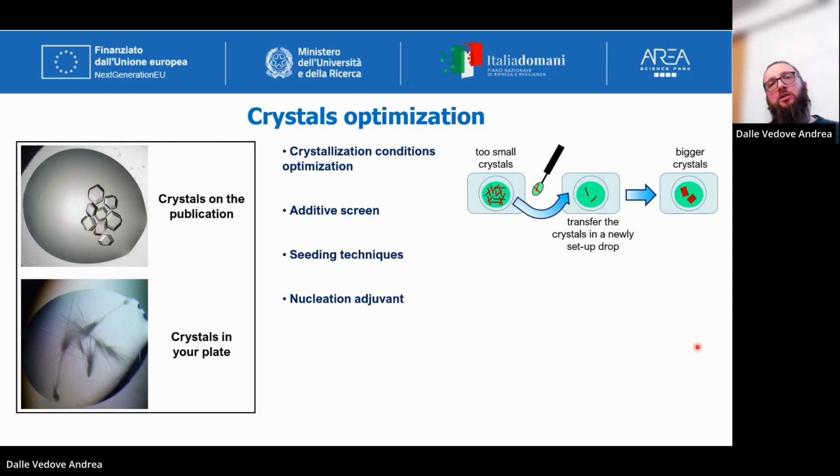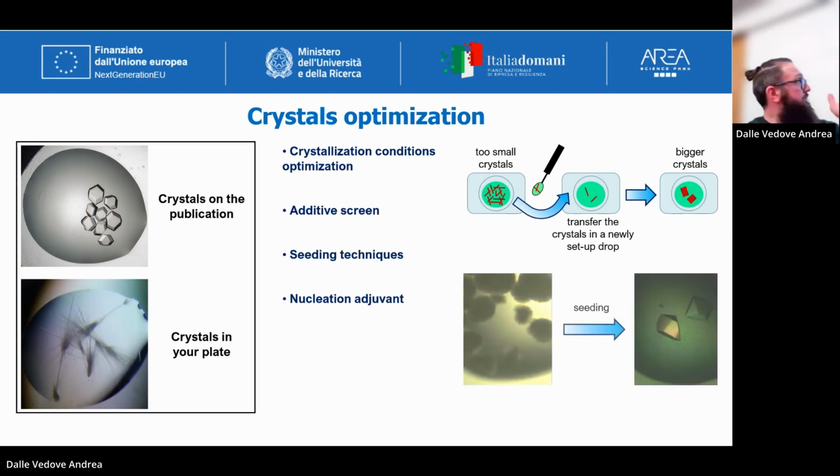In this way, I don't have to reach the azure green area. That means I can skip spontaneous nucleation, and the nuclei I put in from the exterior start growing before that happens. And this can yield, as you see in this real life example of the last experiment we did in the lab, an extremely big increase in crystal quality.